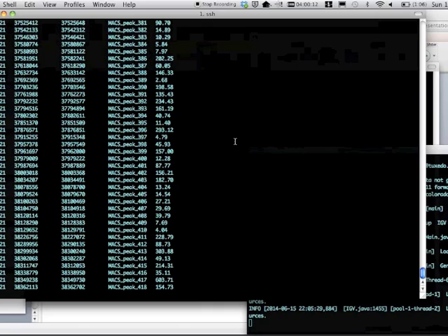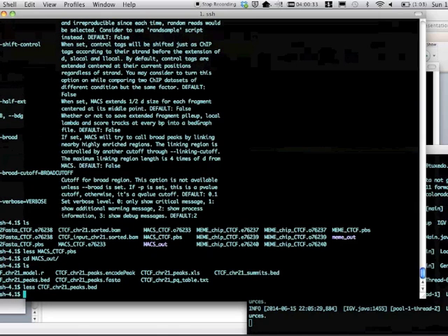One thing you could do, if you were savvy and learned how to write a couple of quick scripts, which I highly encourage that you do, you could use something like Python or Perl to parse this file for only scores above something, and then you could go scores above 200 and go look particularly at those scores.